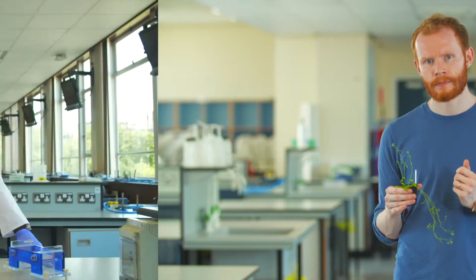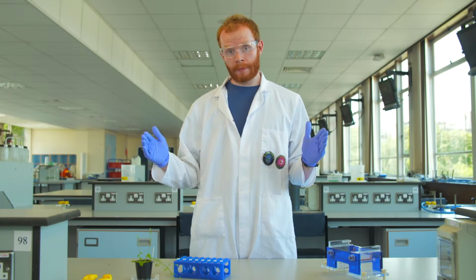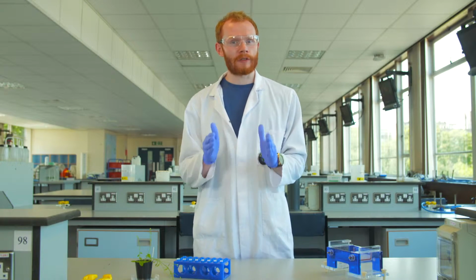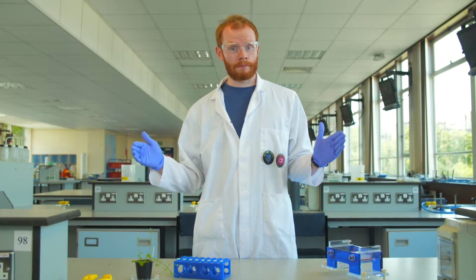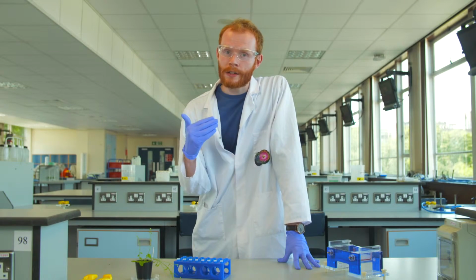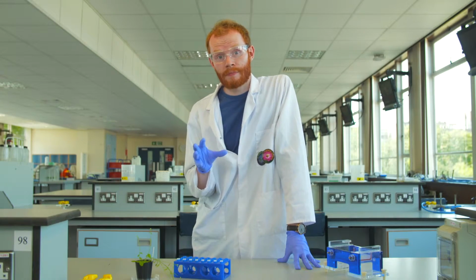Well, one method we could use is a special form of chromatography called gel electrophoresis. Now, let's say I have a plant gene. Using CRISPR, I've purposefully taken a large section out of the middle of that gene, so my mutated gene will be much shorter than my non-mutated gene. Now, using gel electrophoresis, I'll be able to identify which plants do and don't have this mutation.